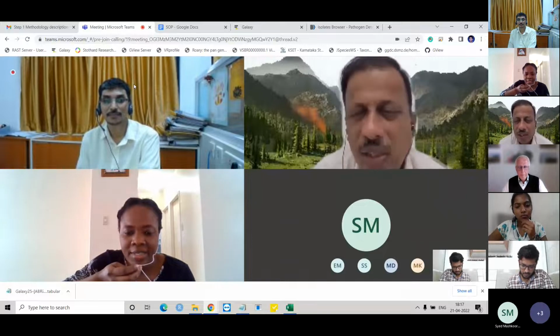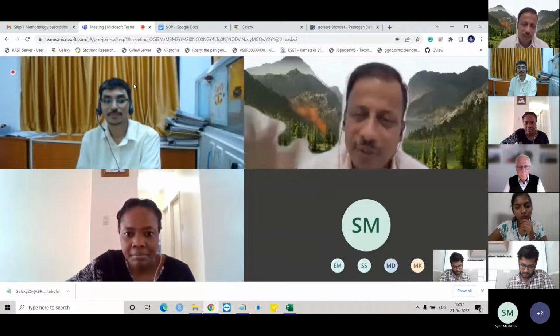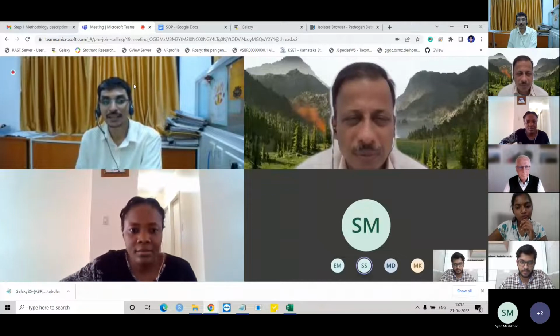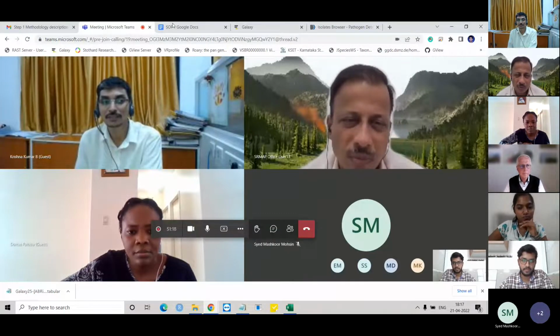Once again, this is part 1 of the work. We have part 2, but we'll do it after finishing this one. Part 2 will be the downstream data analysis, where we will be analyzing the temporal trends. Prithvi, can you put up the SOP?